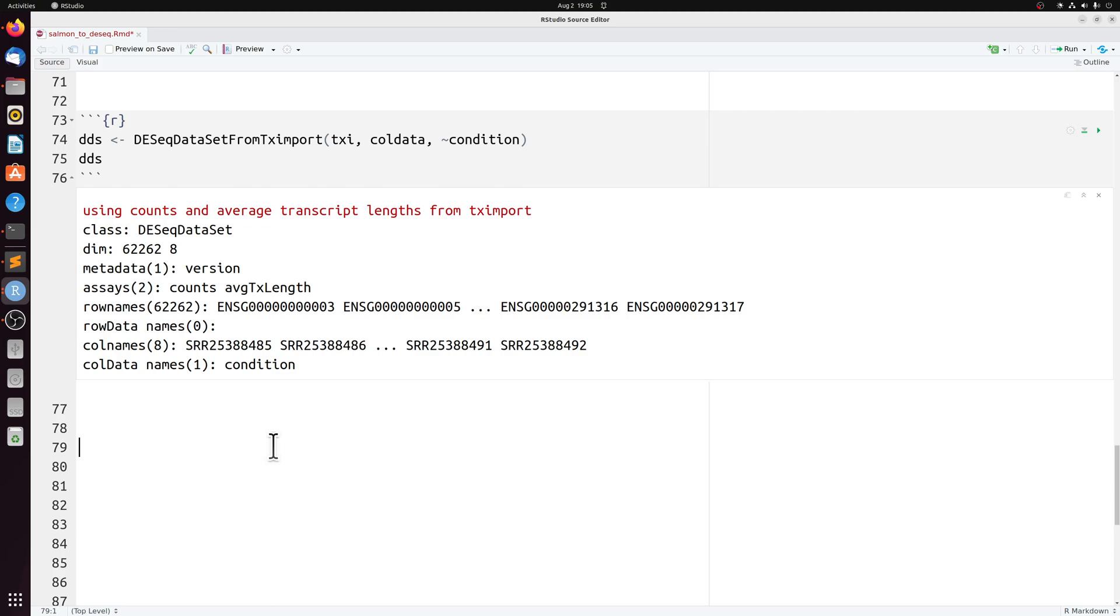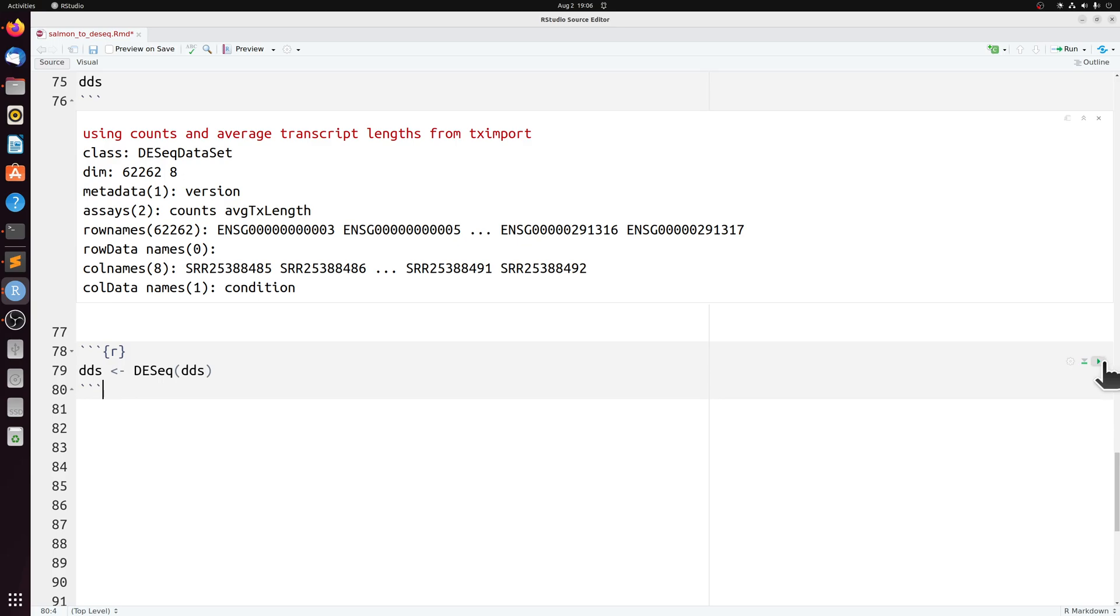And from here, I'm not going to get into the nitty gritty of DESeq. I'll just do a very basic default differential expression, since that's not really the main purpose of this video. But we can run DESeq.